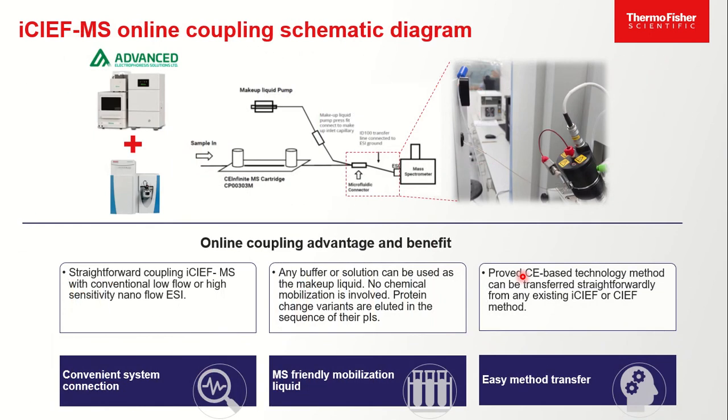Okay, the second case is about the online coupling experiment. Here, a CEInfinite iCIEF coupled with an Orbitrap mass spectrometer was used for analyzing charge variants of pembrolizumab and T-DM1.